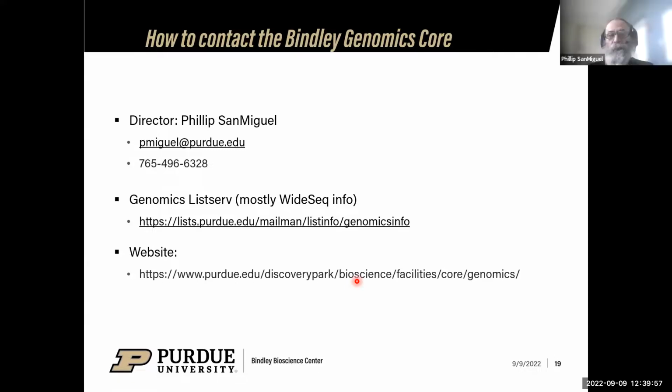Yes. So it would include those informatics that I mentioned on the slide before. Of course, it's possible to come up with something far more complex. You can do additional downstream analyses that might be beyond the scope of what we would be willing to do for you. But basically, doing the assembly of your sequence, the goal is to get a single sequence that will represent your entire plasmid in that example, or something similar to that. And you get all the rest of the stuff. You get the BAM files, you get those various different types of analyses. Yes, that's included in the price. Thanks.